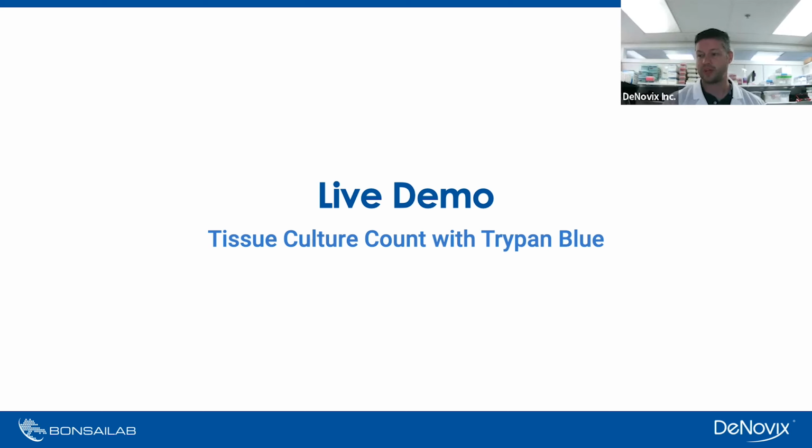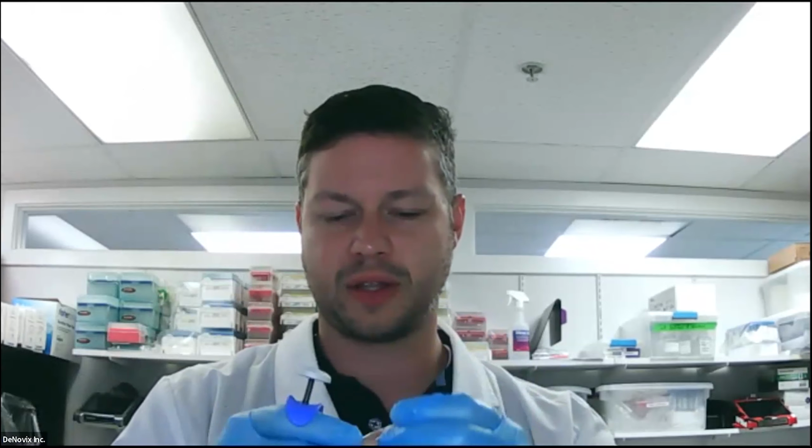So now we're going to move into our first live demo here, which is a tissue culture cell count with Trypan Blue cells. So I have some Jurkat cells here. This is a T-cell, immortalized T-cell line. Bear with me for a second while I mix the sample. And I'm just going to mix this 1-to-1 with Trypan Blue.